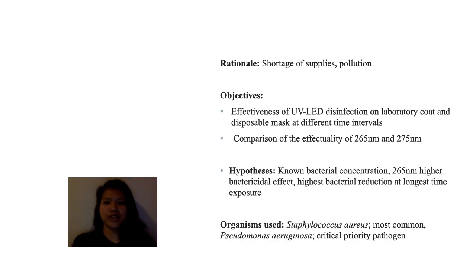Shortage of supplies and pollution brought about by the pandemic is the main reason why the researchers decided to work on this project. And the researchers aim to measure the effectivity of the UV LED disinfection on the chosen personal protective equipment at different time intervals, also to compare 265 nanometers against 275 nanometers.